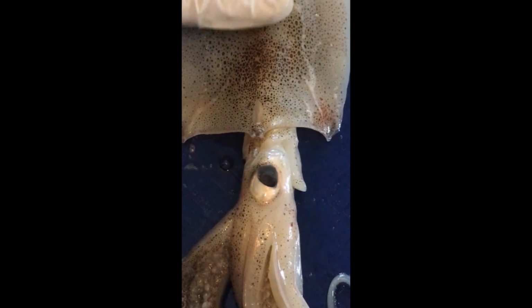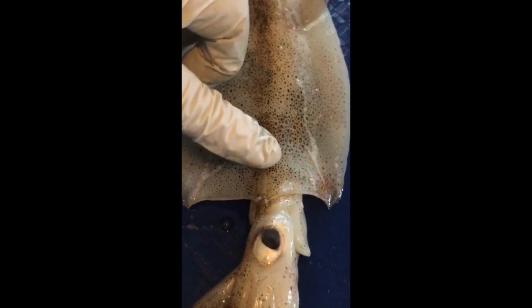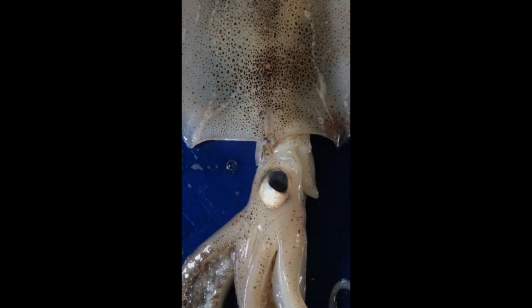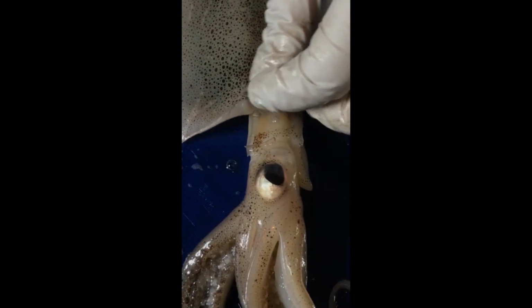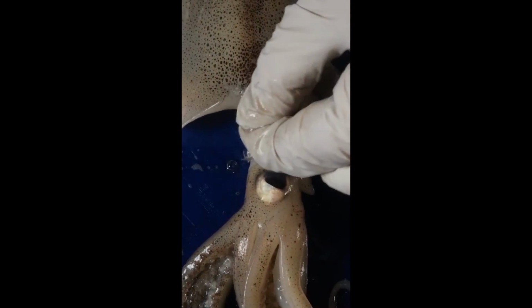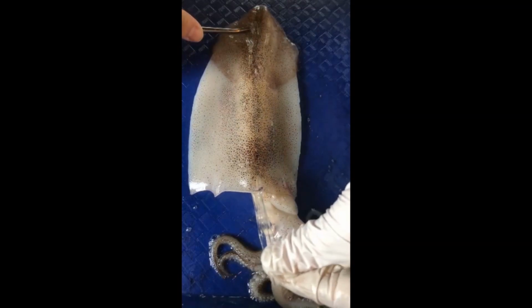I have now flipped the squid onto its dorsal side, so that's its back side. This is the side where it has the pen. The pen runs from the base of the mantle all the way up to the top, center between the fins. So what I'm actually going to do is take the pen out. I will take my scissors, and you're going to snip right here at the end. Just snip that part off, and then lift up and pull the mantle off of the pen, so we can already see that the pen is right here. Then I'm going to pull it out. So here you can see the pen, and I'm just going to pull it out just like that. It pulls right out.